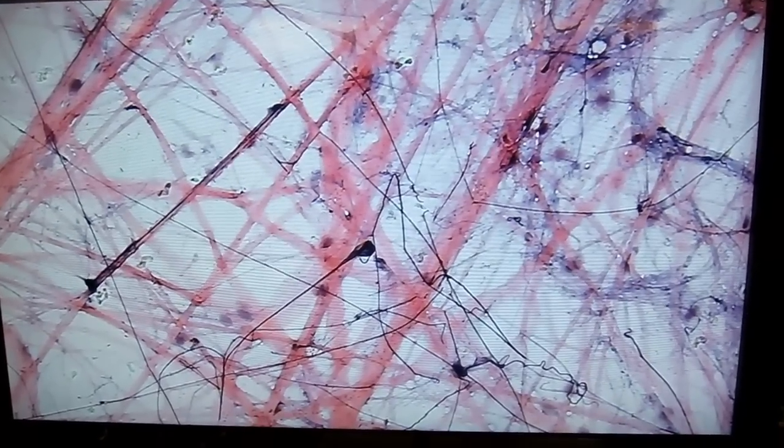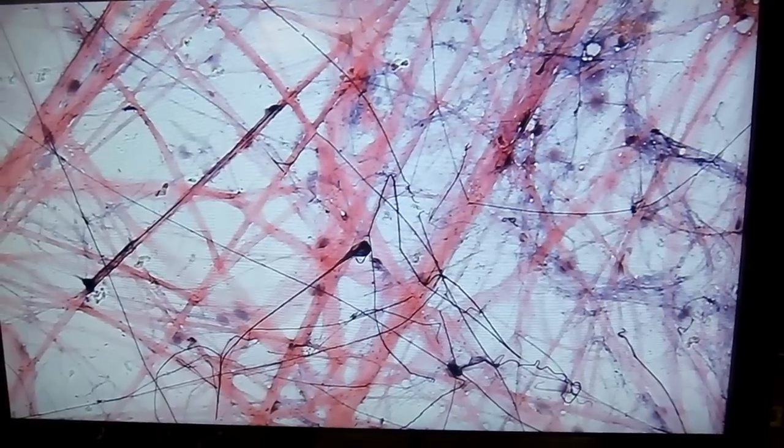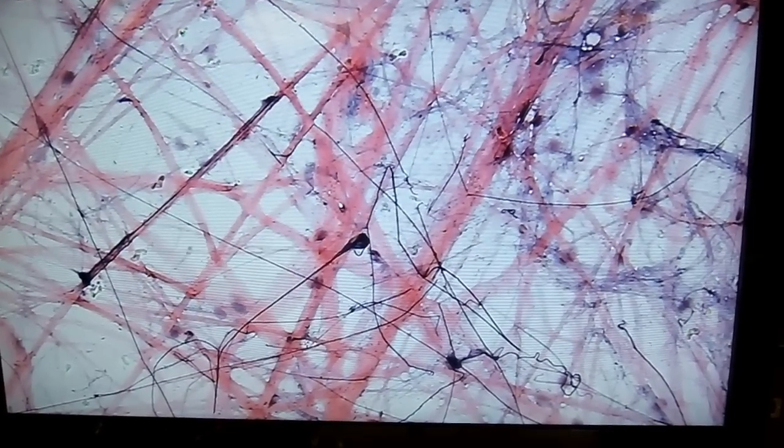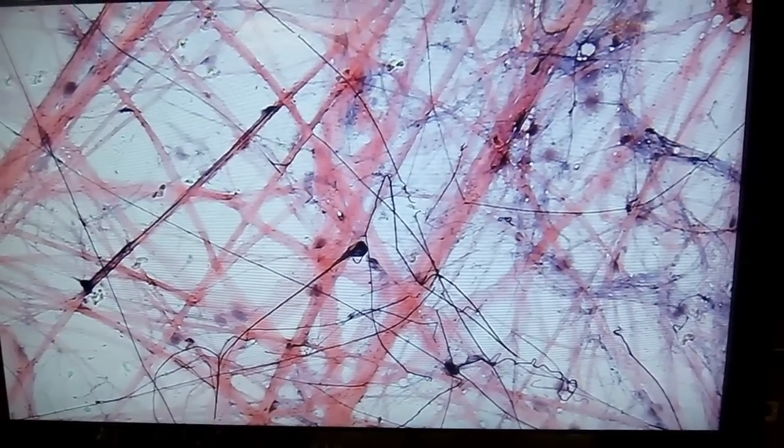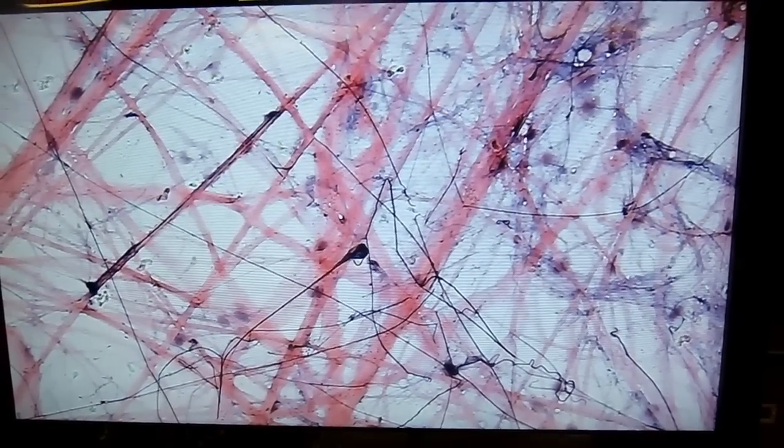So the hallmarks for areolar connective tissue are the obvious collagen and elastic fibers in this random orientation and organization with small numbers of nuclei representing cells scattered around in the tissue. So again, this is areolar connective tissue.